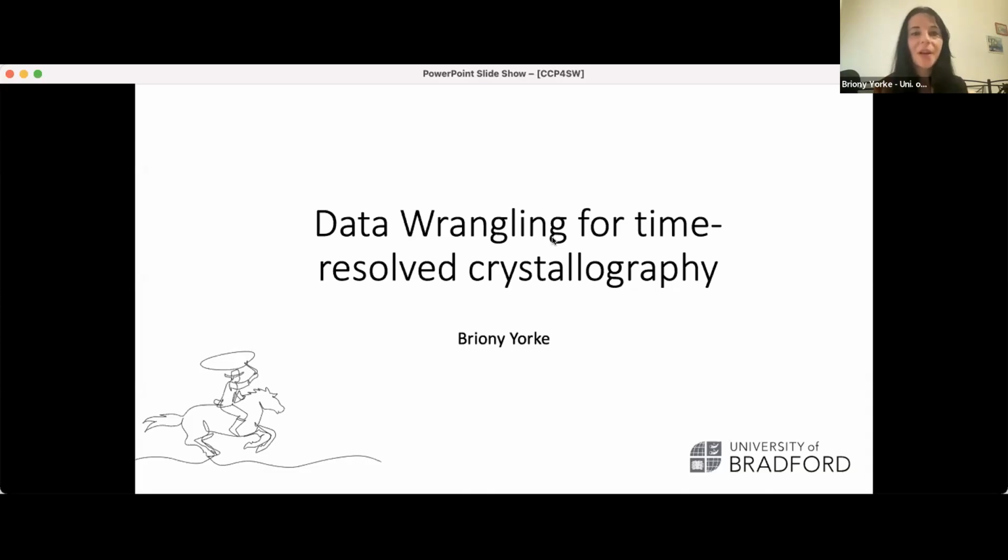Okay, so today I want to talk about time-resolved crystallography and the work that I've been doing, looking at different ways that we can combine data in time-resolved crystallography and how we can play that data in order to get certain advantages over just the standard approach.